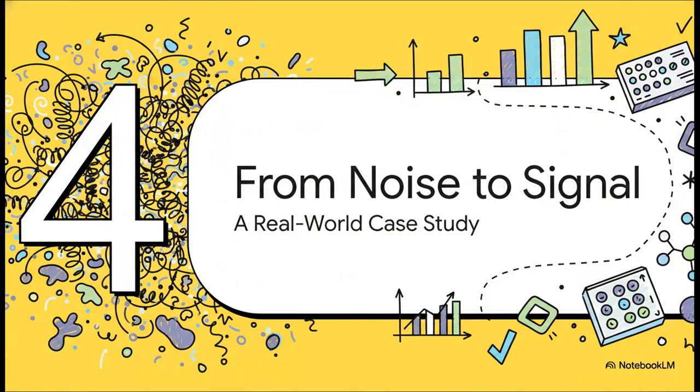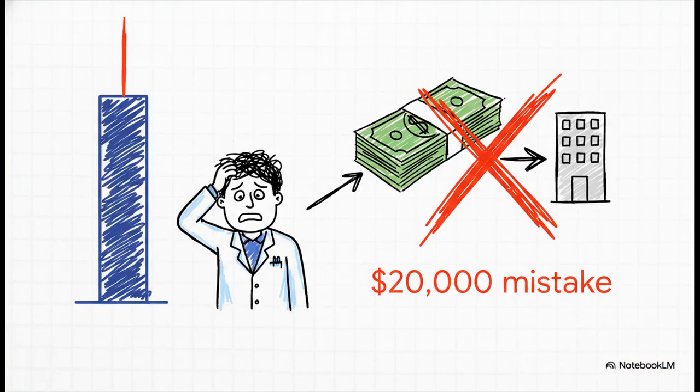Now, this all sounds pretty good in theory, right? But does it actually work in a real lab under pressure? Oh yeah. Let's look at a case study that shows just how dramatic the impact of this can be. So, get this. A lab was in a really tough spot. They were struggling with this critical IL-6 ELISA. Their coefficient of variation, their CV, was over 25%. I mean, that's just incredibly noisy, totally unreliable data.